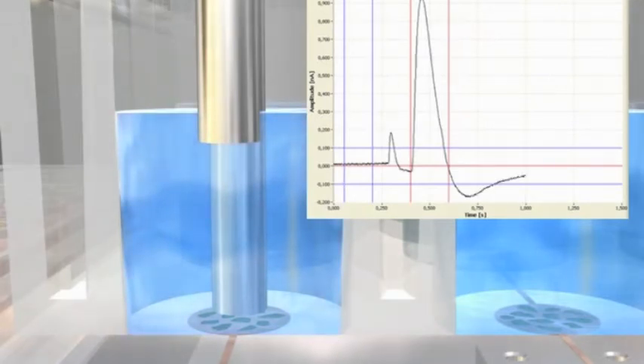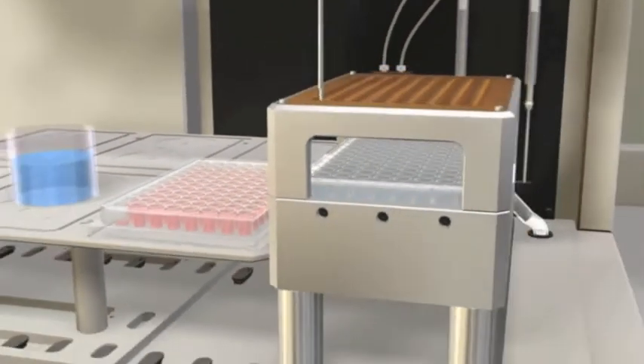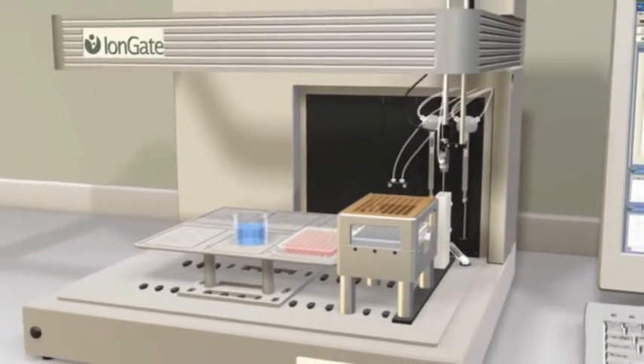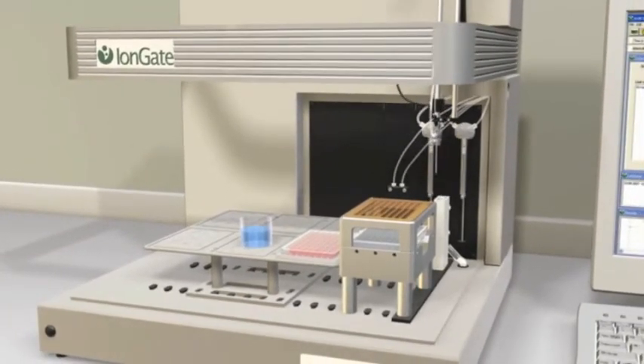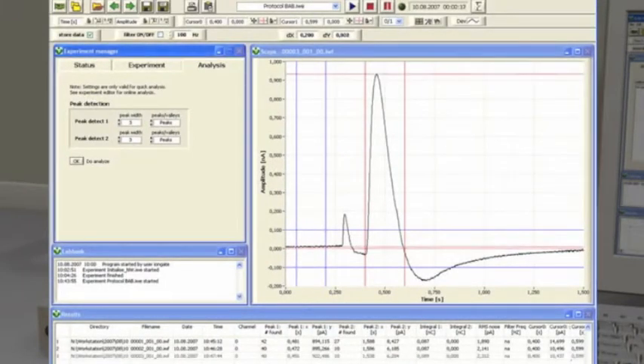State-of-the-art surfer software controls data acquisition and offers a comprehensive set of analysis tools. Sensor capacitance and conductance are routinely detected for quality check. Convenient analysis of data is provided by automatic determination and documentation of peak current amplitudes or area under the curve. Corresponding values are saved in the resulting file.